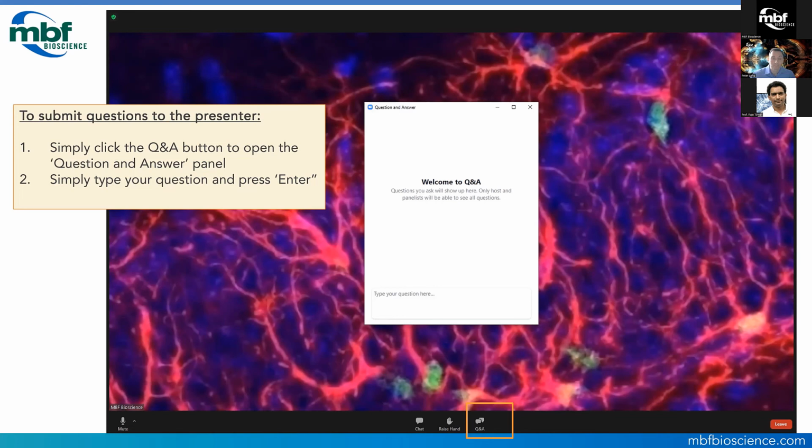If you're interested in using antibodies to label specific molecules, then iDisco, at least in our hands, gives good results compared to other methods. All right, great, thank you.